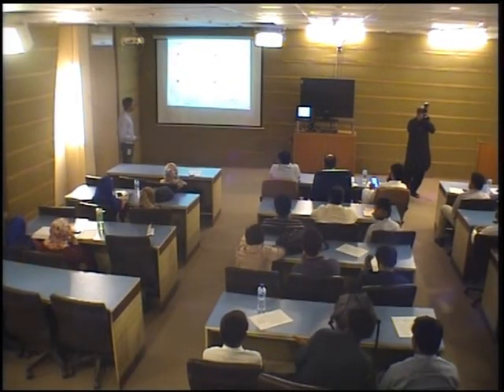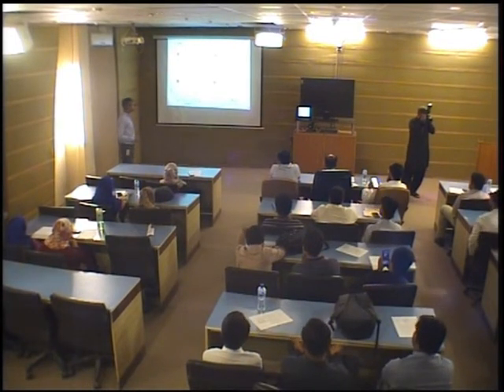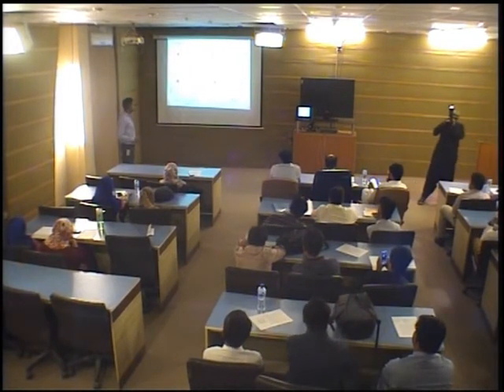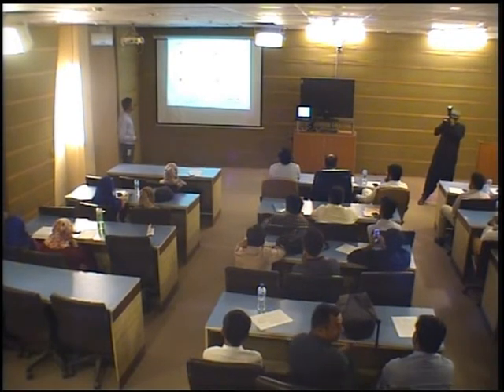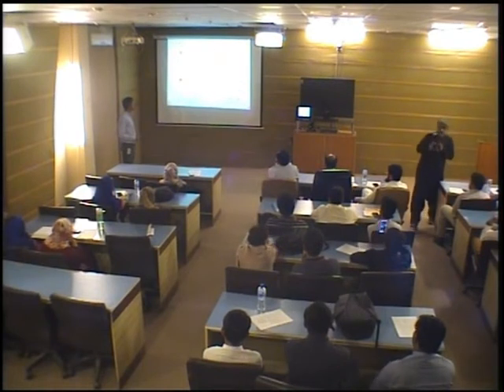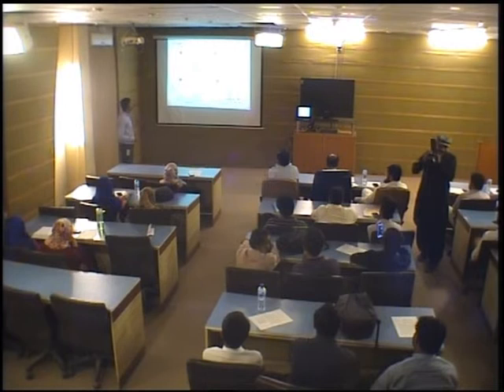While in figure C, we have observed titanium, lead, manganese, mercury and iron lines. In figure D, we have observed calcium, chromium and iron lines. Meanwhile, in figure E, it starts from 438 to 458. We have observed iron, titanium, calcium, mercury and barium lines.